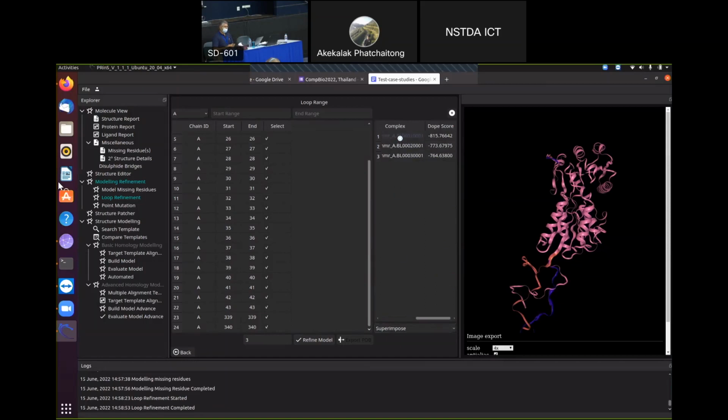So now we can go for the next step, where we can go for point mutation. If you want to mutate the protein, which most probably you have to do if you are working in a multi-target environment, you might want to use multiple mutations and then run your screening. In this case, we are not doing it. We just run one protein at a time.